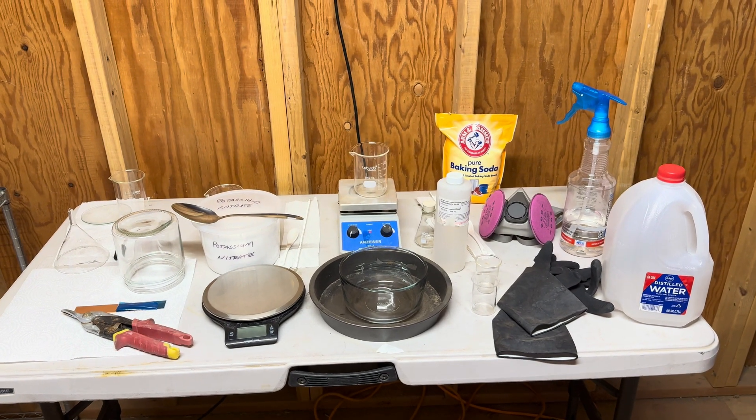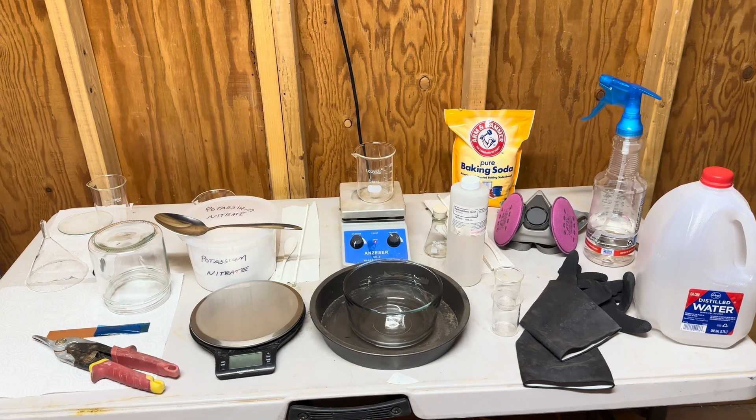Hello everyone, I'm Ernie and I'm so glad you're here with us today. Today we are going to make some poor man's nitric acid and let's get to it. Here is our setup in the background on the table.